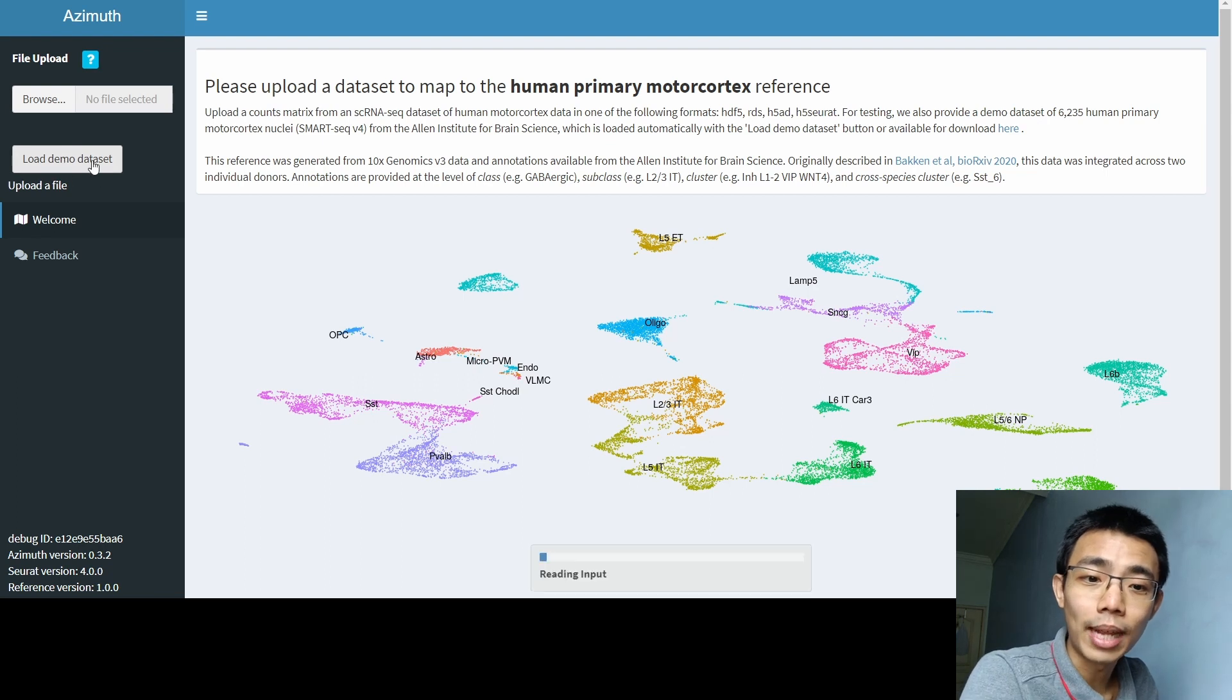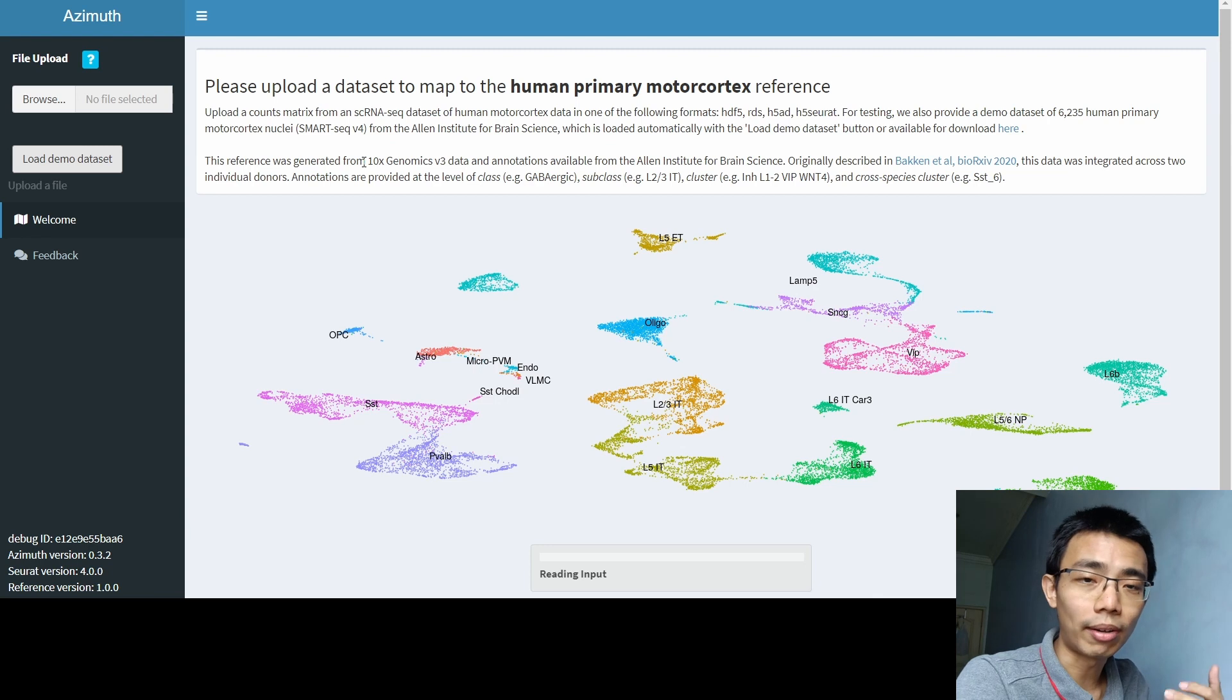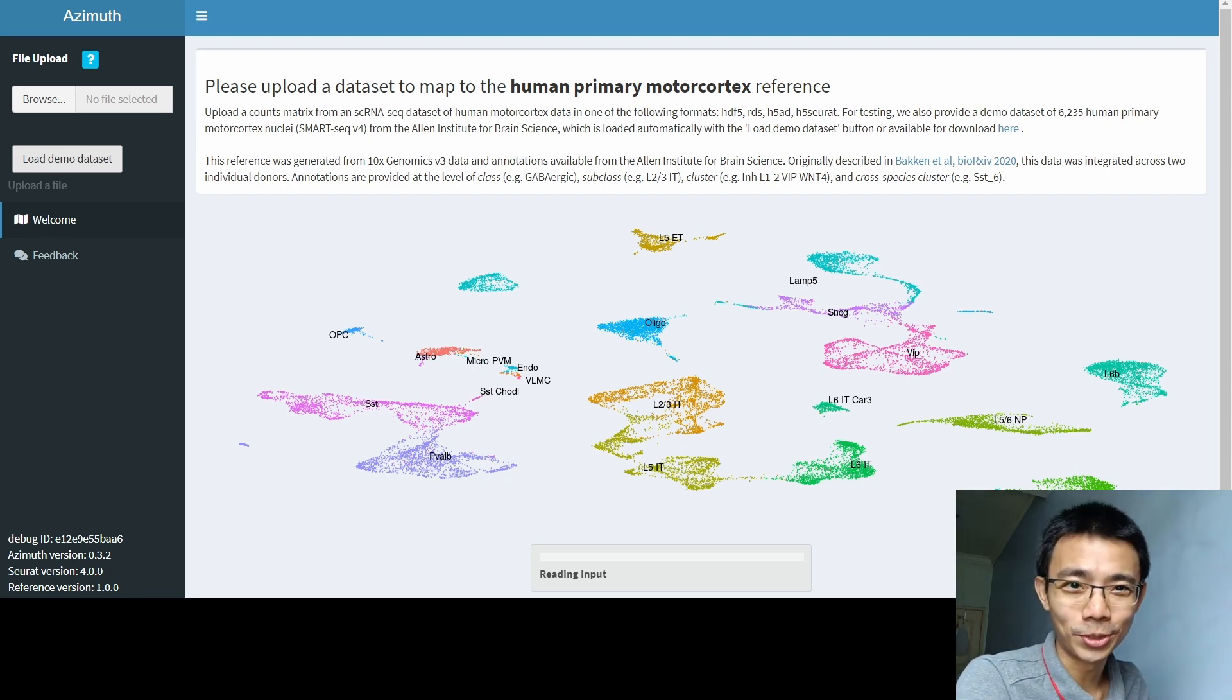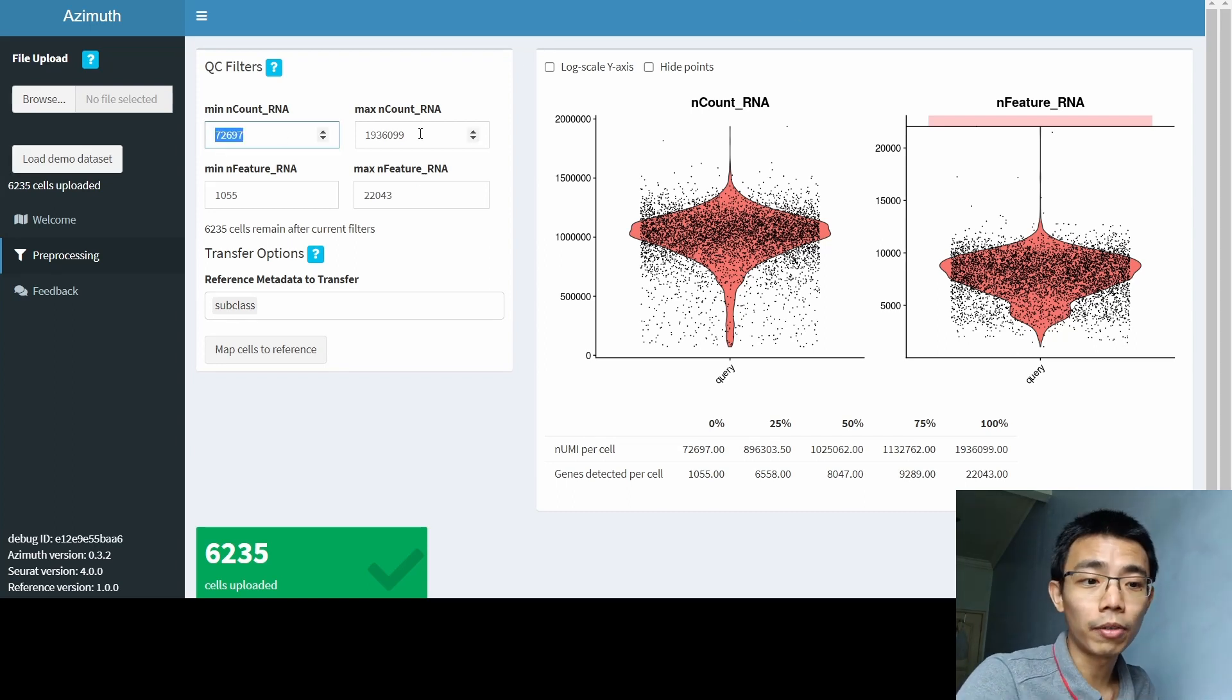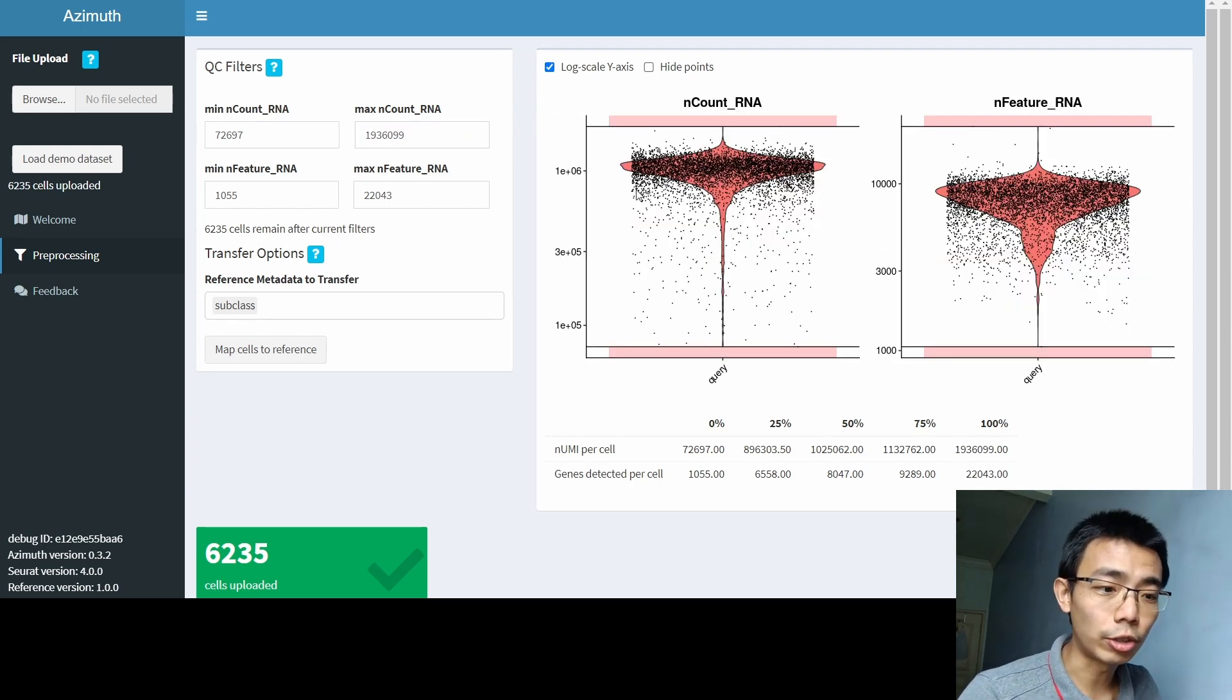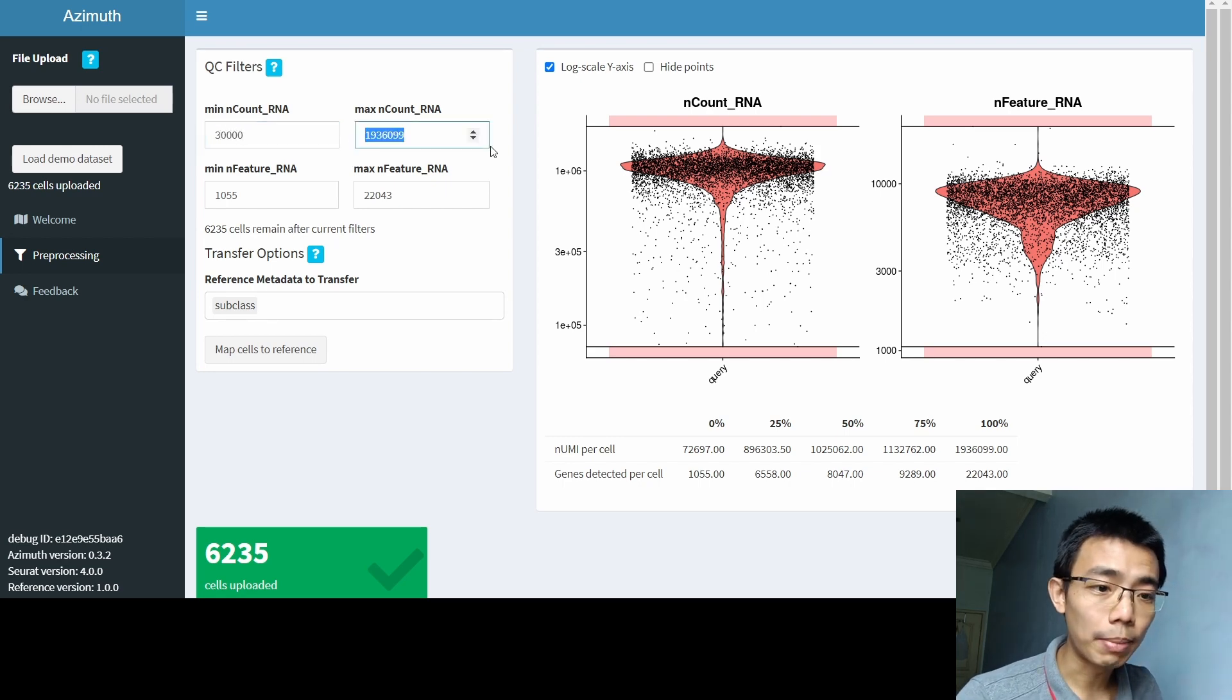But for now, I'm going to load a demo dataset to actually just get it to run. And again, because you're not running on your own computer, it might take some time. And if you are uploading a big file, it might actually take more time again for you to do so. Once the upload finished, you'll be greeted with something like that, where you can actually adjust the minimum count and maximum count of the nRNA. I usually go for the log scale y-axis and then adjust based on that, based on the violin curve.